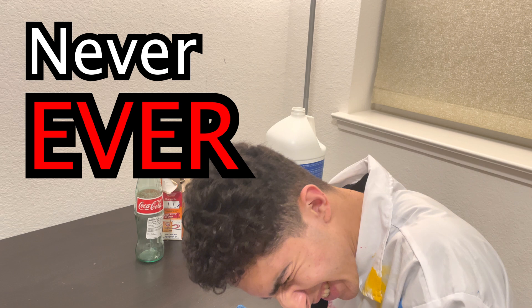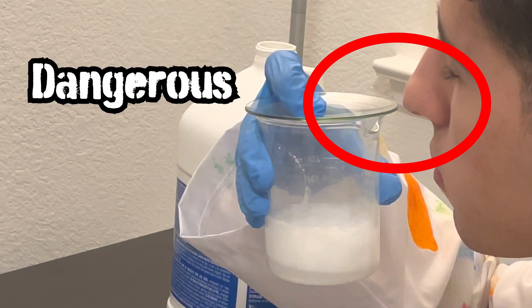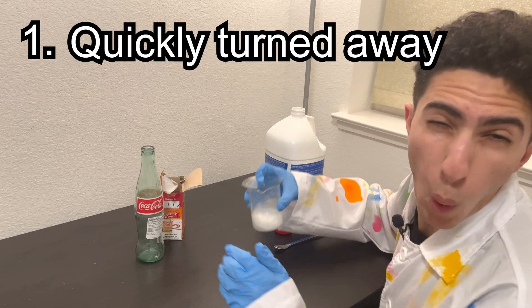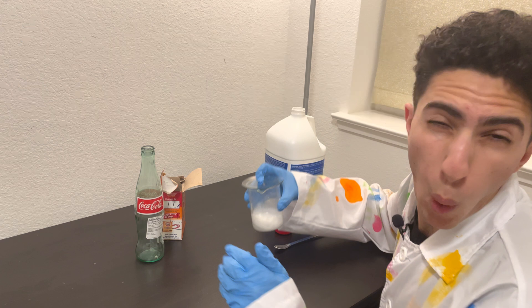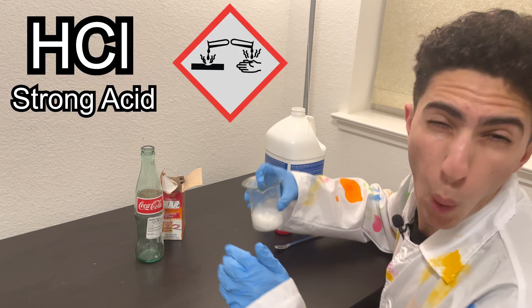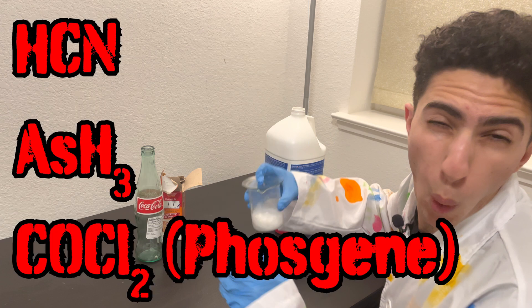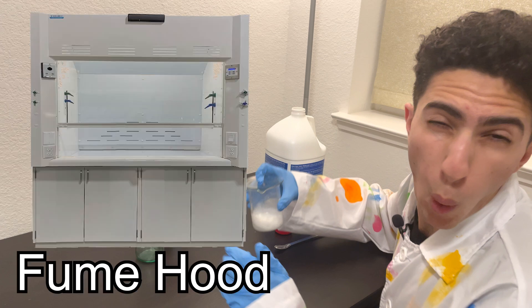Never, EVER do what I just did here. Putting chemicals directly under your nose to smell them can be very dangerous and, in some cases, even fatal. The only reasons I am not dead are: one, I quickly turned away after a single whiff, and two, the vapors I inhaled consisted mainly of CO2 and HCl. HCl, being a strong acid, is very corrosive, and CO2 exposure in high concentrations can lead to suffocation, but neither can cause immediate death. However, there are other chemicals where a single whiff can be enough to kill you, and with chemical reactions you can't always be certain of what chemicals you've created. With reactions that produce gases or involve volatile liquids, it is usually best practice to run them under a fume hood and never smell the products.